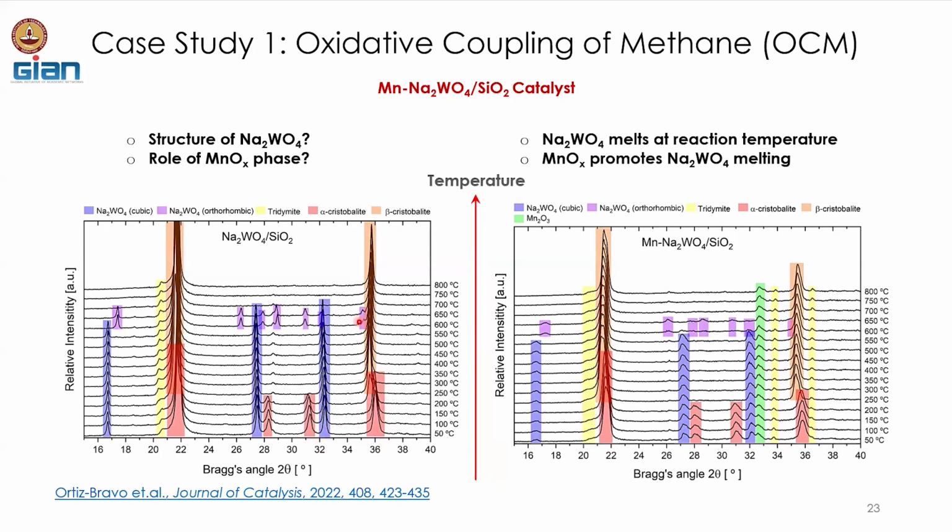The alpha cristobalite phase of the sample is present there. Whereas, if we go to higher temperature, starting from here, 250 to say 800 degrees Celsius, as you can see, there was this peak at about 2 theta of 36 degrees, which corresponds to the alpha cristobalite, but then there is this other peak at about 35.5 that corresponds to the beta cristobalite. As we can see, the phase transformation from the alpha phase to the beta phase is happening around 250 degrees C, and that is what we are able to see from the XRD.